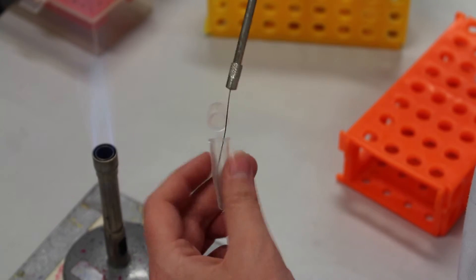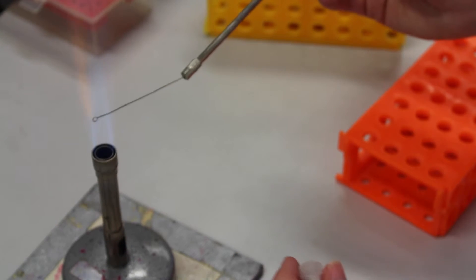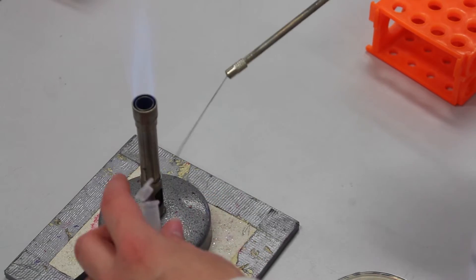Swirl the loop around carefully in the tube containing distilled water. Sterilize the loop. Swirl the loop in the tube.